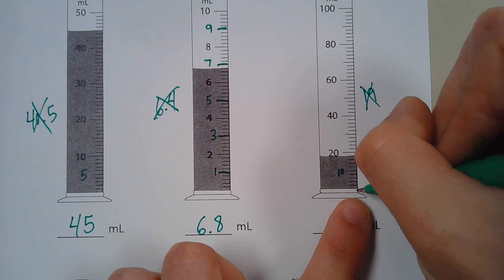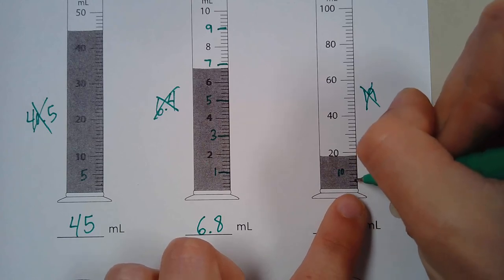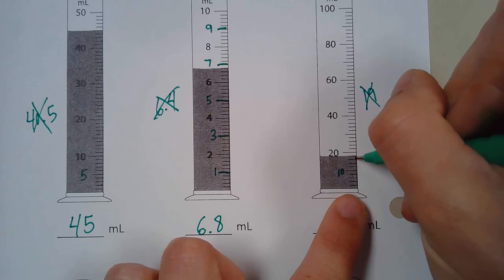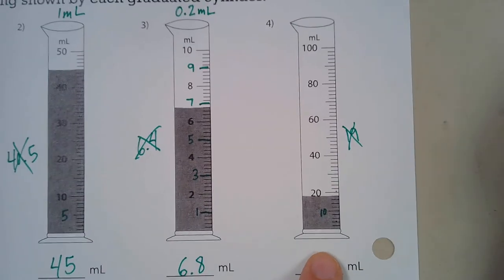So if we count by 1s, 1, 2, 3, 4, 5, 6, 7, 8, 9, 10, that's not the right scale for this graduated cylinder.